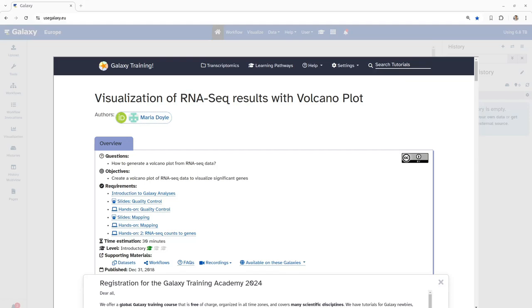Hi everyone, I am Sai Mohman from the European Galaxy team Freiburg in Germany. In this video we will be focusing on visualization of RNA-seq results with volcano plot using Galaxy.